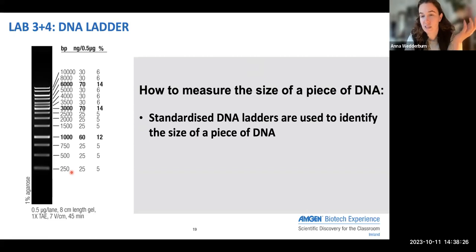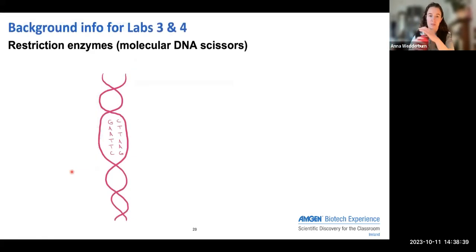So we run them in this case just to act like a control almost, so that we can see that yes, the DNA has worked, or the gel has run. So that's what the DNA ladder is.